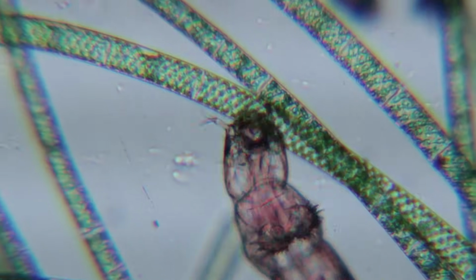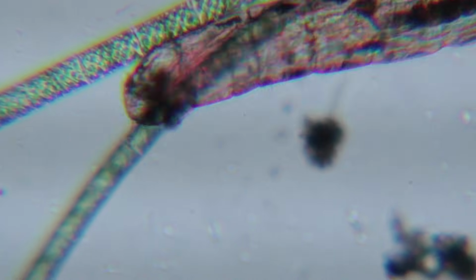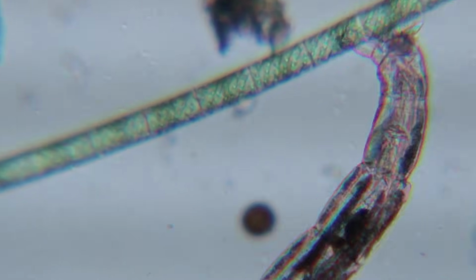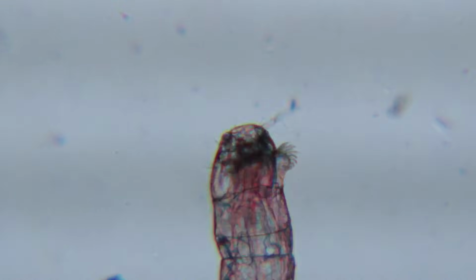Now, whether he's moving this fast because he is hunting, or he's just moving like this because he's stuck between two bits of glass, I'll leave up to you. Either way, he's definitely aggressive, and I'd say he'd be preying on those little Paramecium and anything else that he can get his jaws around.